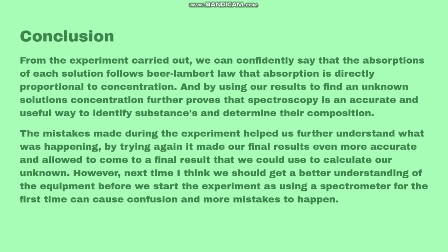However, next time I think that we should get a better understanding of the equipment before we start the experiment, as using a spectrometer for the first time can cause confusion and more mistakes.